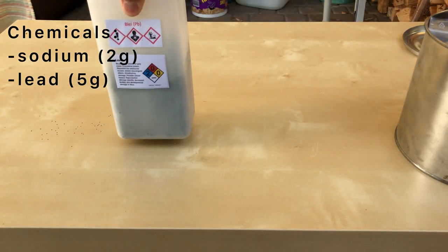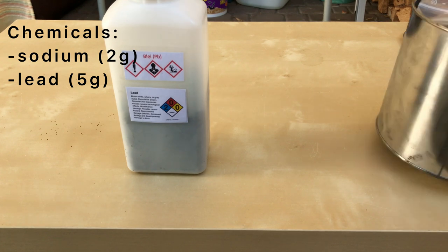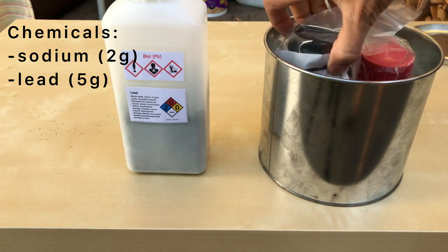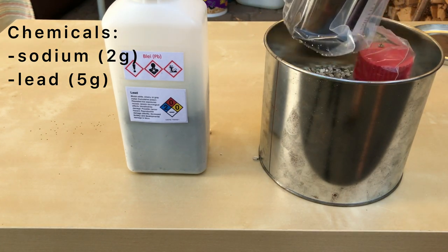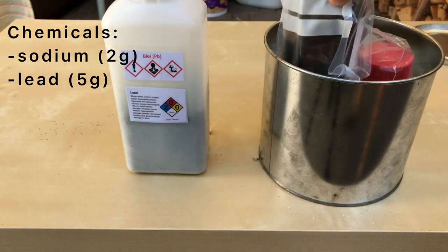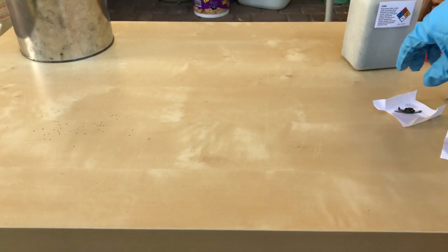Welcome back. Today we are going to make some lead sodium alloy. For this, 2 grams of sodium and 5 grams of lead are needed. Lead sodium alloy is useful for drying various solvents without being too violent.